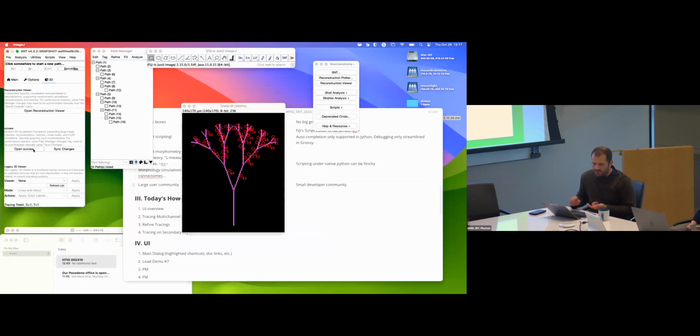We have SciView, which I'm not going to show you today, but that's where Kyle joined in. SciView is becoming a powerful 3D viewer for ImageJ. It supports VR, it supports meshes, images, masks, and so on.